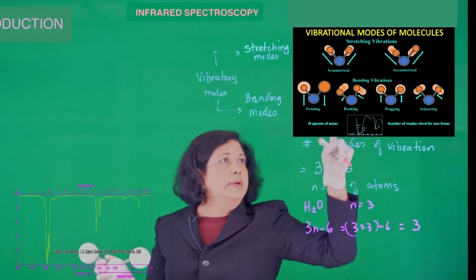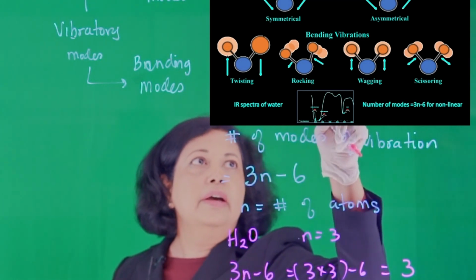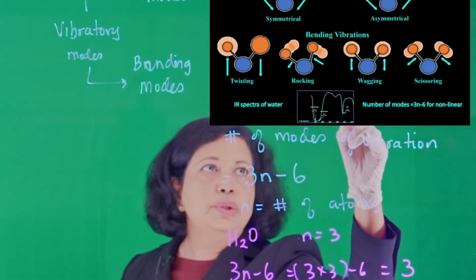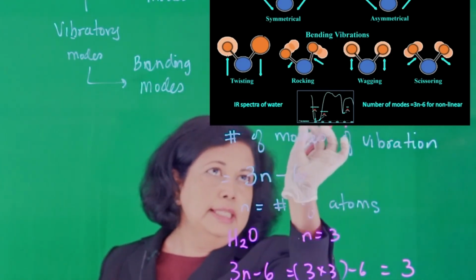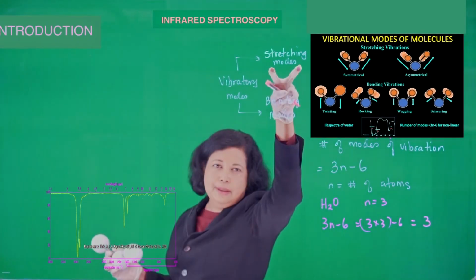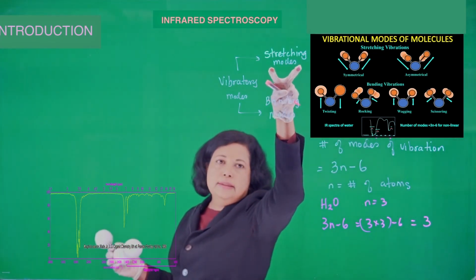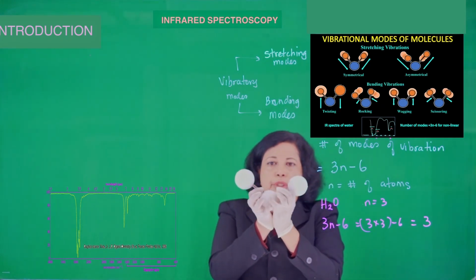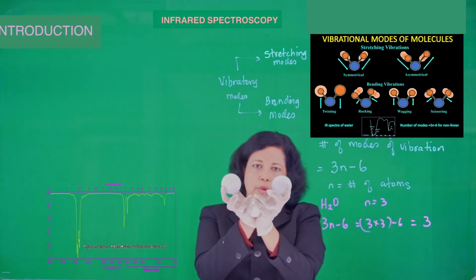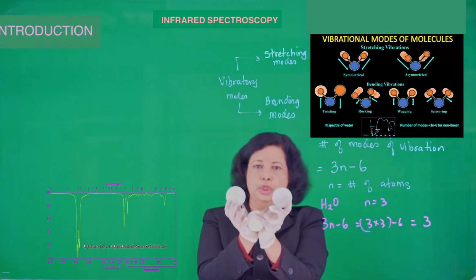And what are they? You can see a small spectrum down here for water. All right, you can see there are 3 peaks. And here's one. This one really has 2 kind of merged. If you look at the bottom, you can see there's a little bit of an indent there. The lower energy would be the bend. And then the higher energy vibrations are the stretching. So water is going to do symmetric stretch, which is just going up and down here, or asymmetric stretch.